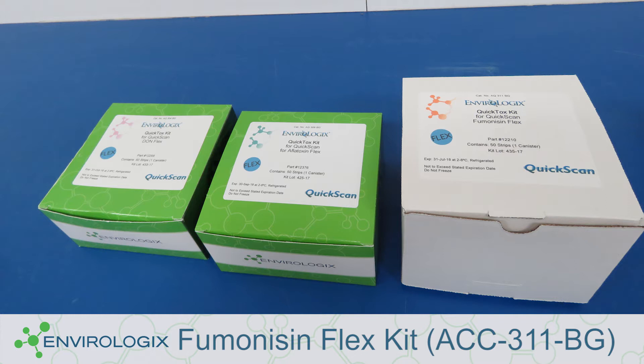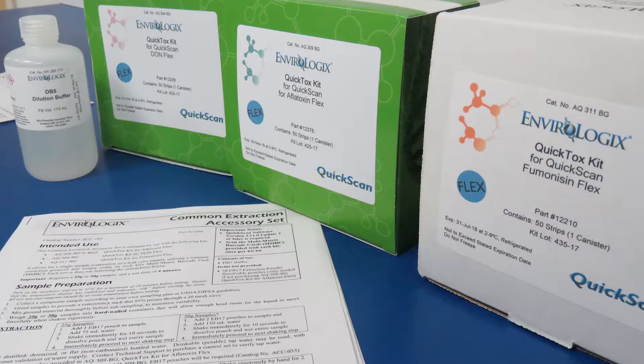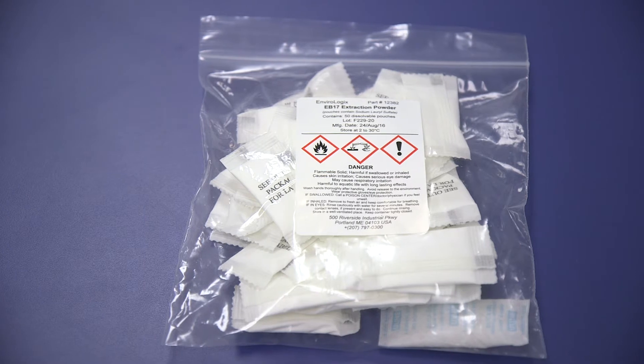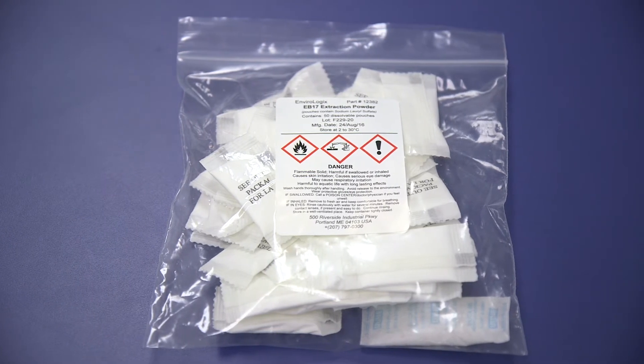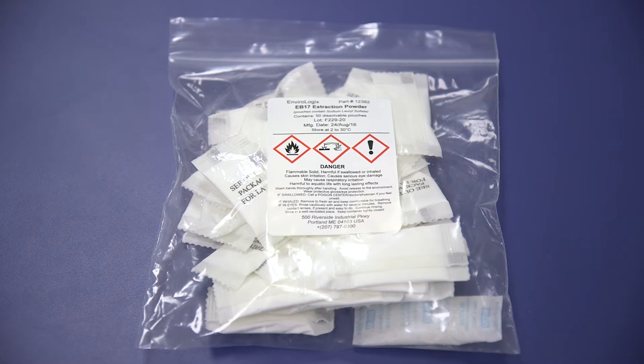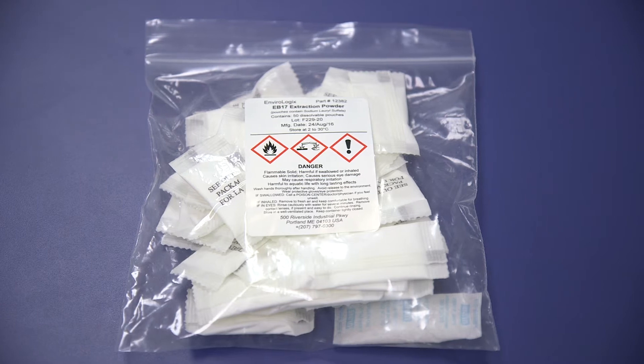The following items are not provided in the common extraction set but are required for testing: FLEX mycotoxin kits, 50 EB-17 extraction powder dissolvable pouches. These are only required if testing 50 gram samples for GIPSA certification or if you are not purchasing an Aflatoxin Flex kit.